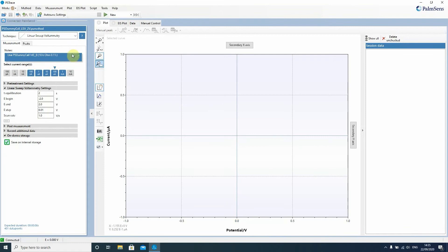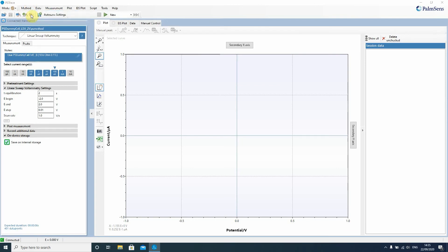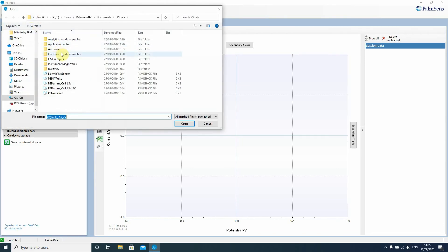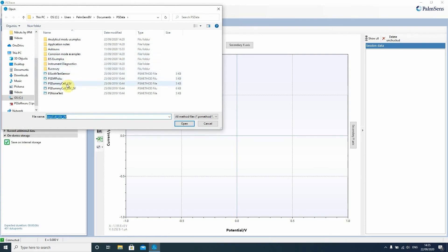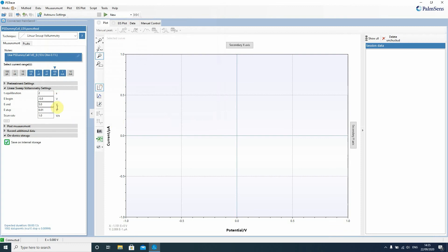To make your first measurement very easy you can just load the method file. The method files store all the parameters for a measurement. You can use that easily to share measurement parameters with your colleagues. So you just click on method, you click on load and this one you will find in your documents in the PSData folder and there you will find PSDummyCell LSV. Just click on it, open it and it loads the parameters.